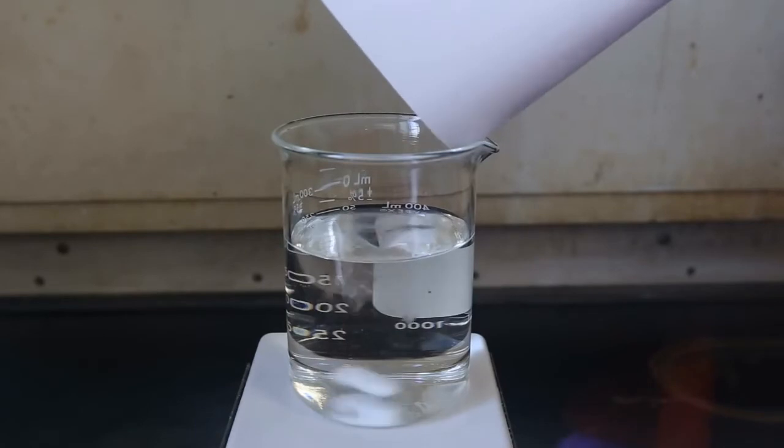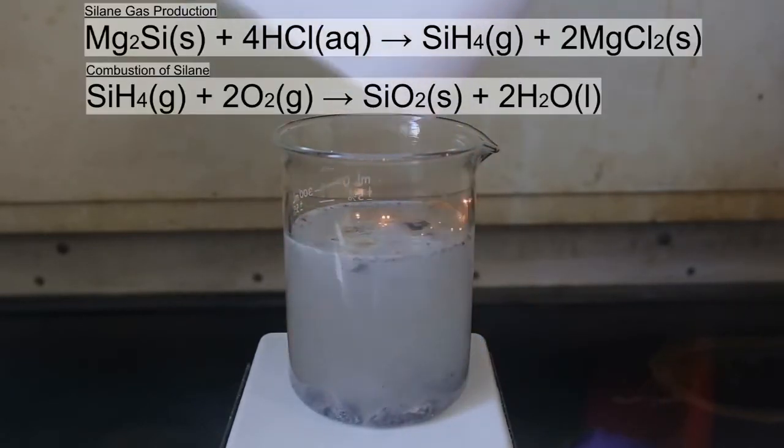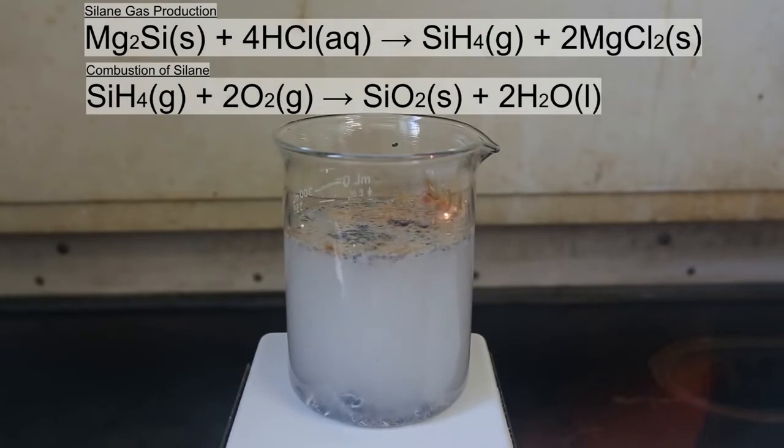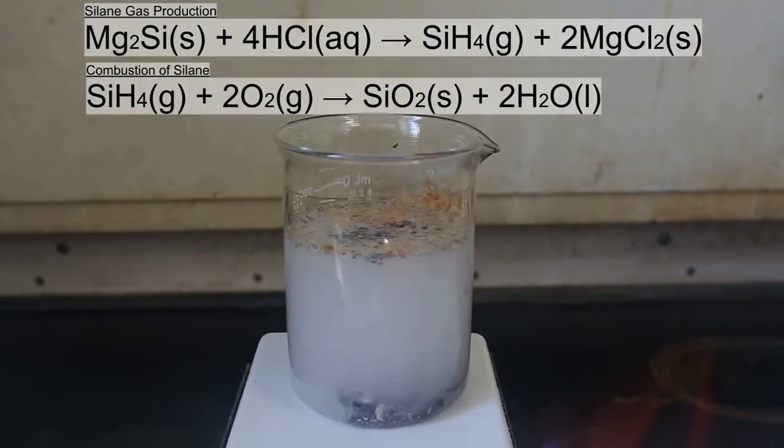Next, I poured all of the magnesium silicide into an acid solution. The reaction taking place is shown above. The magnesium silicide reacts with the hydrochloric acid to produce magnesium chloride and silane gas. The silane gas bubbles up through the solution and immediately ignites upon exposure to air. The silane gas reacts with oxygen to reform the much more stable silicon dioxide. A lot of the other bubbling you see is magnesium oxide and unreacted magnesium metal reacting with hydrochloric acid.